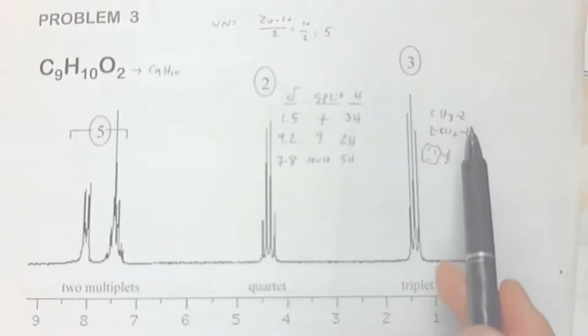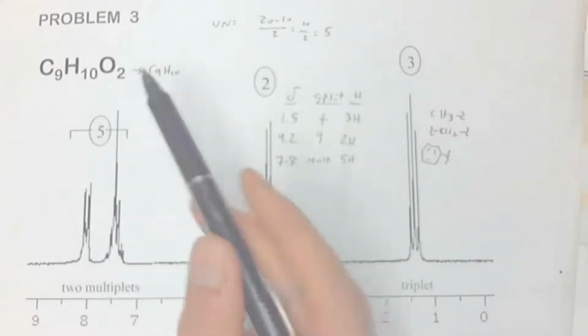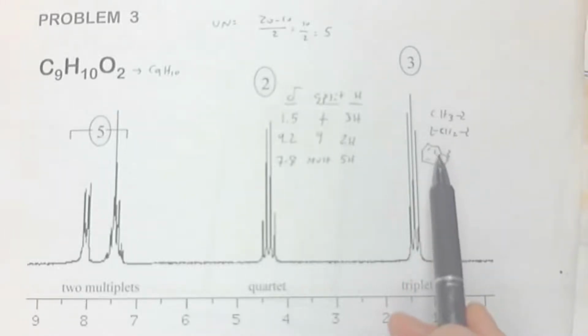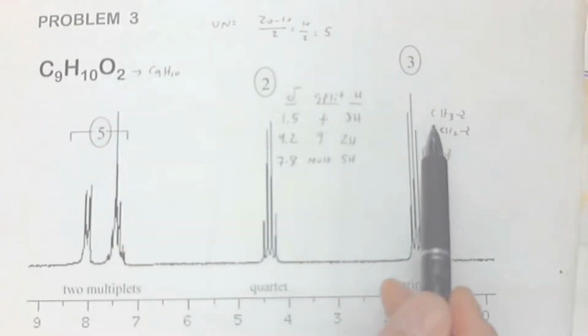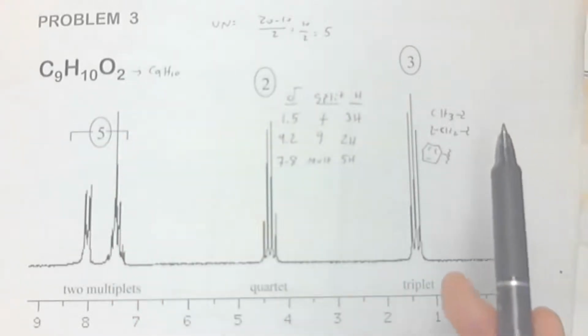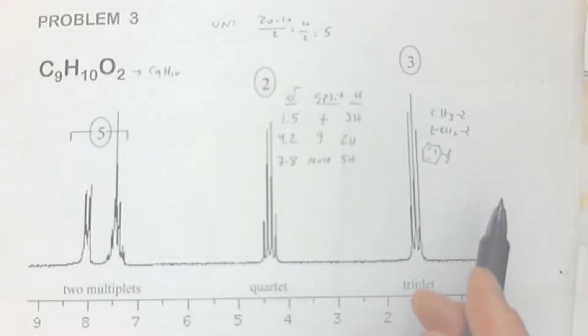Well, no, we're not, because we count everything up and we're missing the oxygens, for example, right? It looks like that's 1, 2 plus 6 is 8. 8 carbons. Okay, we're missing a carbon. Hydrogens we should have. 5 plus 5 is 10. So we're missing a carbon and we're missing 2 oxygens. Okay, now we have a non-ketone mystery functional group. The last 2 problems were ketones.